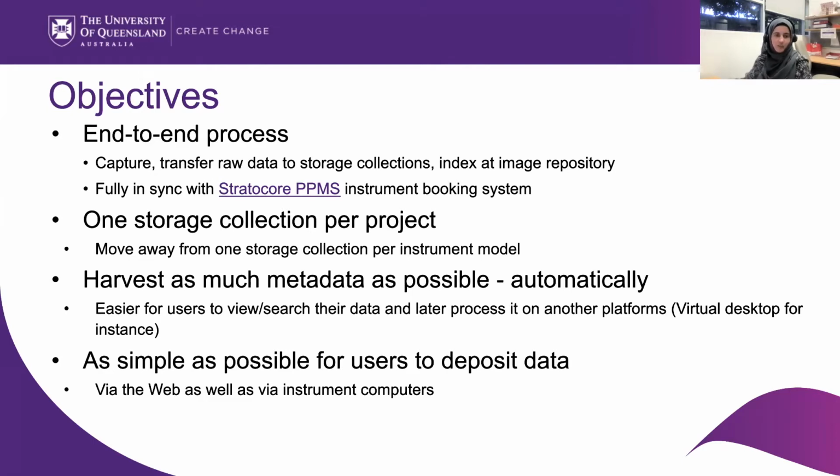This was the approach we had: move away from one storage per instrument model. This is what we did. And like I mentioned, it needs to be FAIR, and that's where metadata is highly important. It makes it easier for users to view and search their data and later process it on another platform, for example CVLs or anywhere. And the most important thing is making it as simple as possible for users to deposit data.